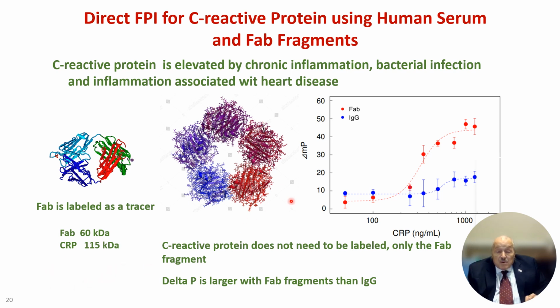The C-reactive proteins are surprisingly large, on the order of 115 kilodaltons. They're pentameric proteins. And if this labeled FAB unit binds to here, you know you're going to get an increase in anisotropy. And this is what I said, these anisotropy assays are popular because you know they're always going to give you an anisotropy.